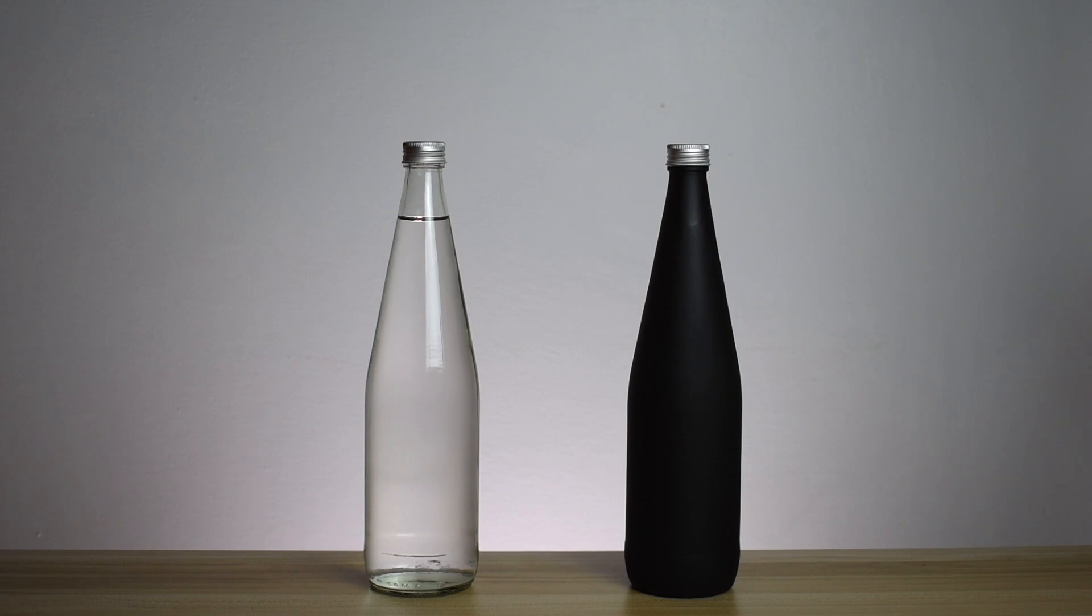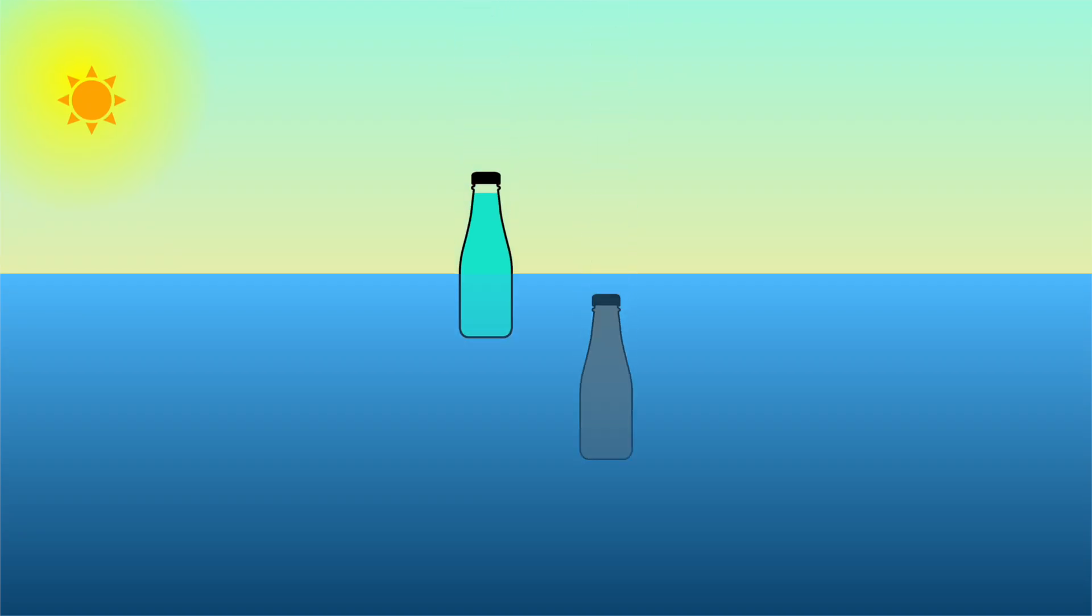Next, you need to leave the bottles for a while so the phytoplankton can do their thing. Ideally, you should keep the bottles in the environment you took them from. This means the temperature and light intensity the bottles are exposed to match the true conditions of the ecosystem you're testing. This is called in-situ incubation.